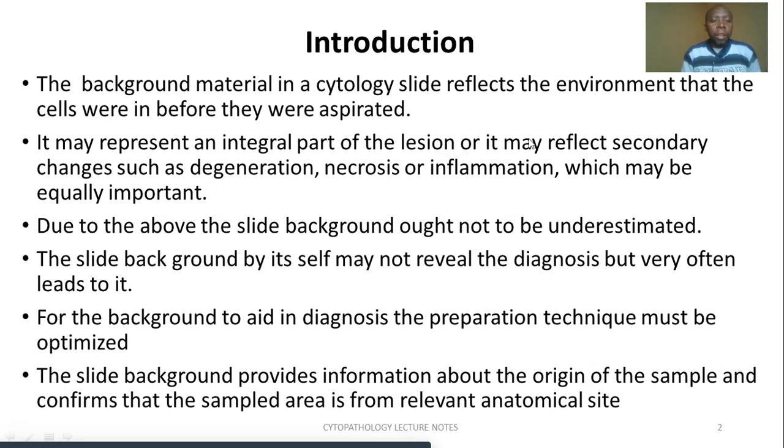From the time of sample collection to the time when we report our results, how we handle, how we prepare, and whatever procedures we take determine how good and how reliable our results would be. So even in this case, the background of the slide that we intend to analyze must be optimized.